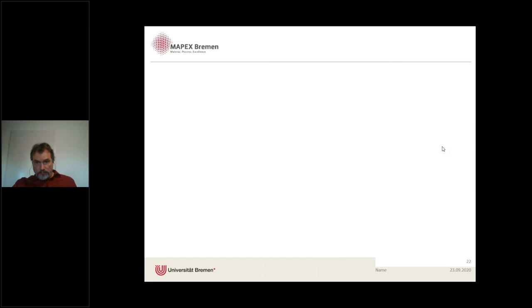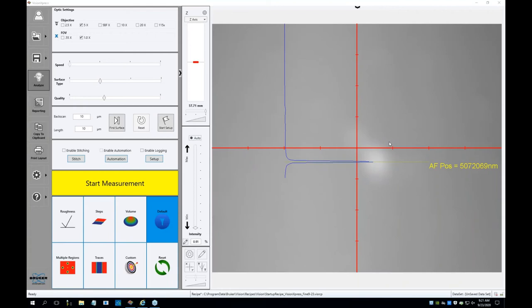So now it's time for a quick session about the questions you asked along the way, and one of the questions we had was about how fast the measurements are. So the main idea is to quickly show you how long it takes to hunt for 2D materials over a silicon surface, like graphene.